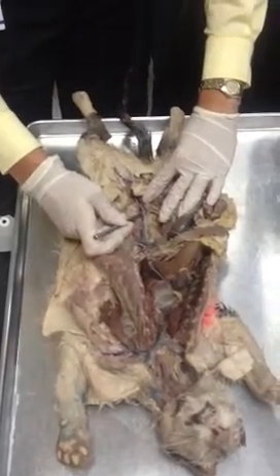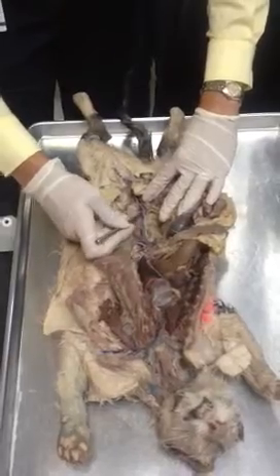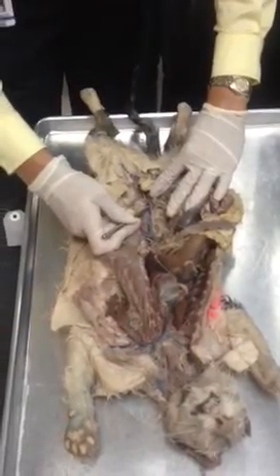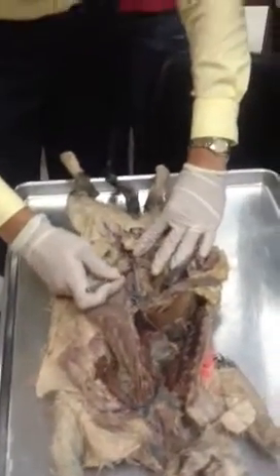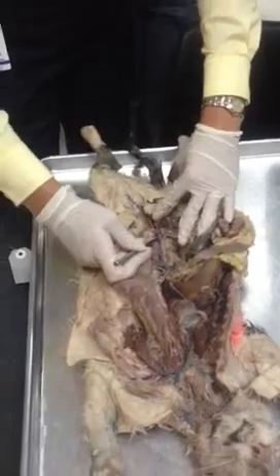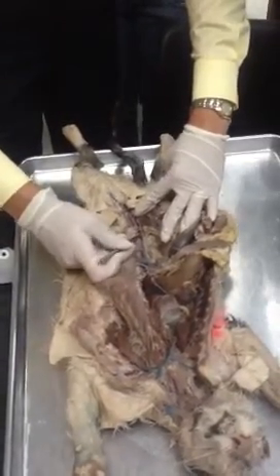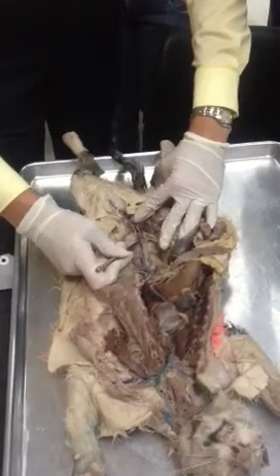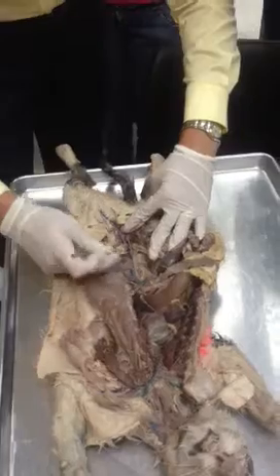Now aorta continues, and here they call it something sacrolumbar or something, but this is just really analogous to lumbar arteries in humans, right? Only thing that we have more than just one. We have as many as 5, right, for each as a lumbar segment, right? Now here will be lumbar, and I think they call it something, I cannot remember in a cat, all right?